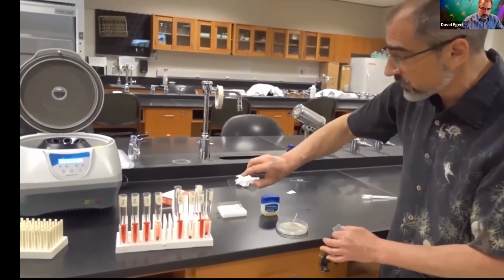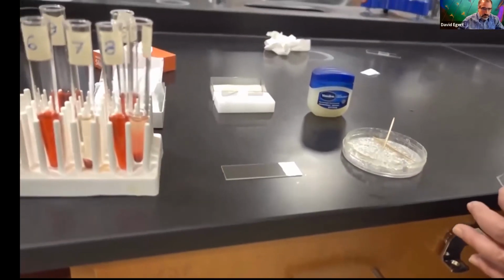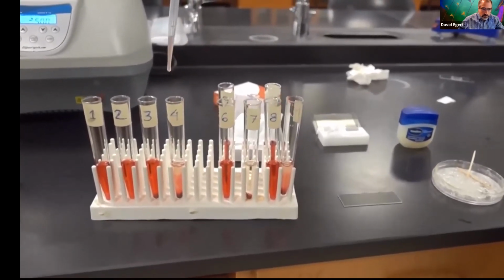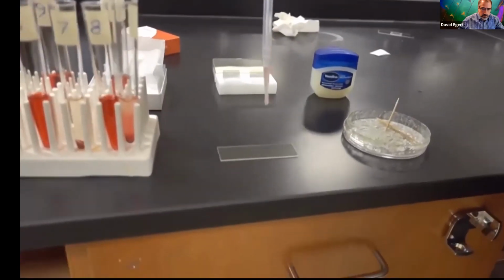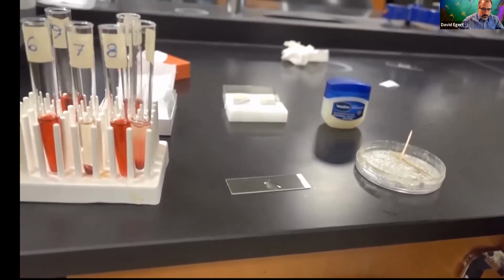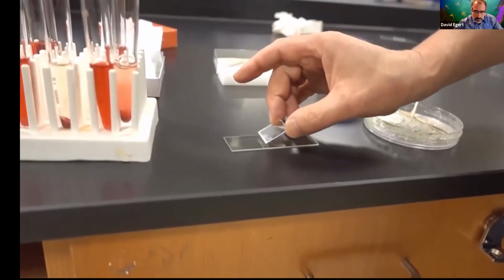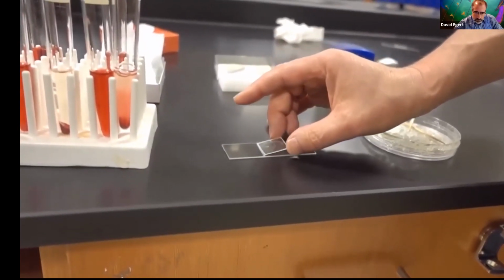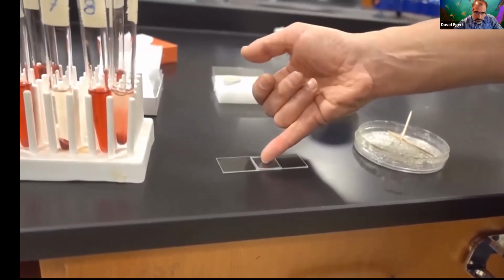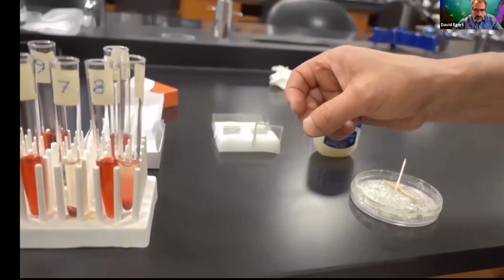So here is my slide. I'm going to take a drop of my resuspended blood cells here. That's probably plenty. I'm going to take my cover slip and start one side, drop it down. I'm going to use the back of my fingernail. I have to push it down a little bit. And what we have now is a sealed wet mount.